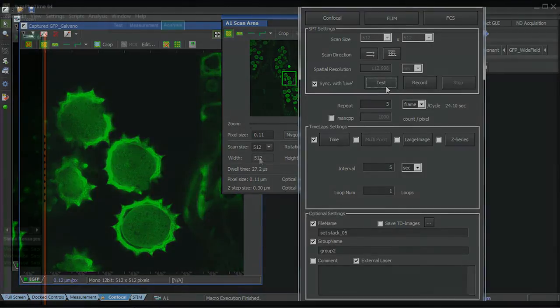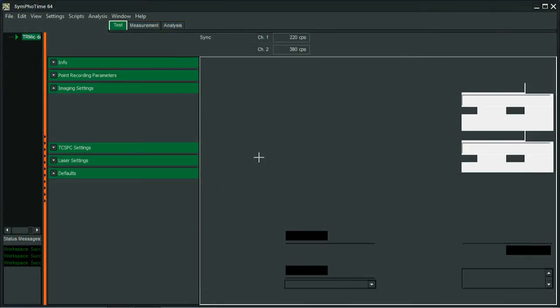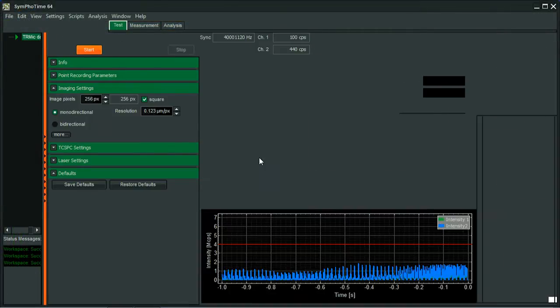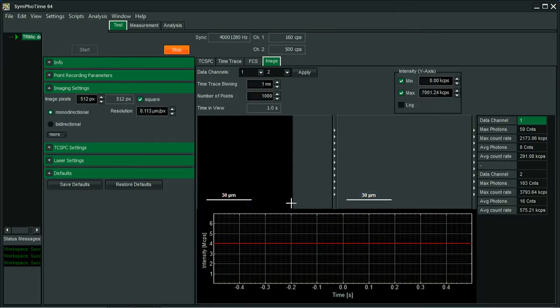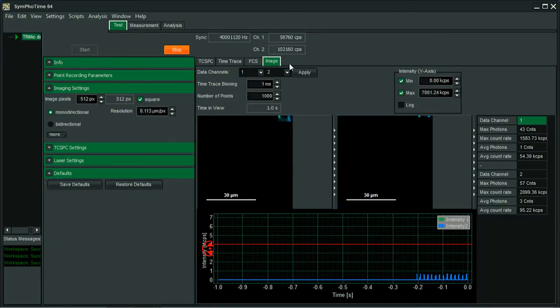To do all these settings in this macro plugin we go to the FLIM button and here we click to test. When the test is activated we see that the SymPhoTime here starts to measure.